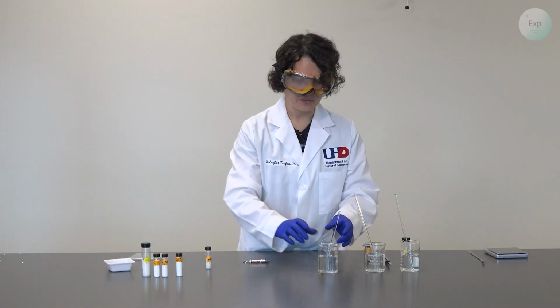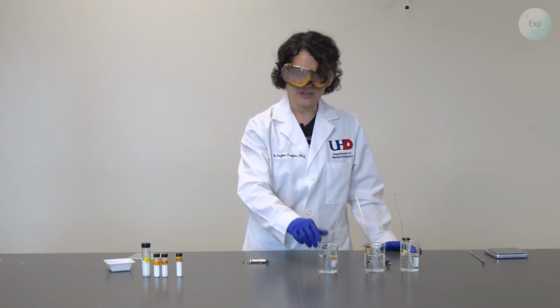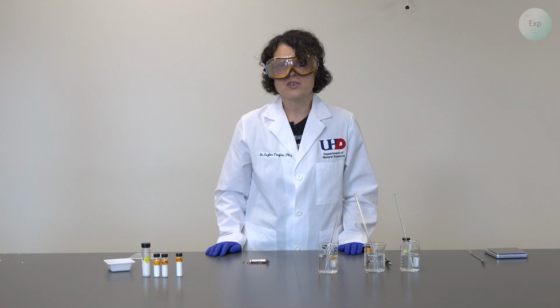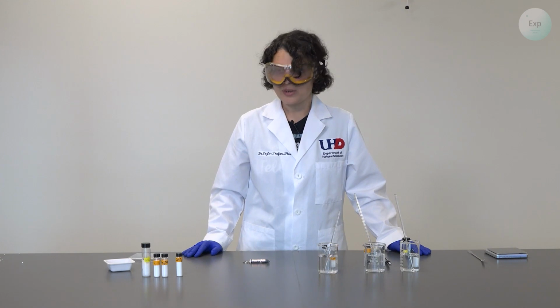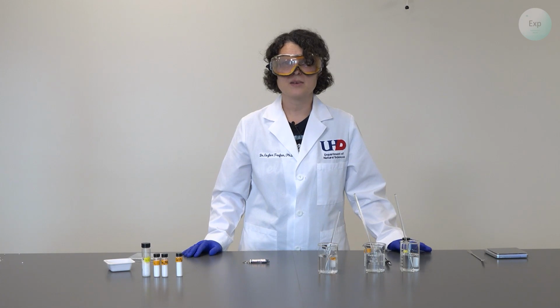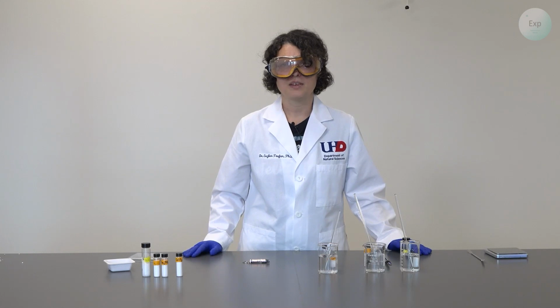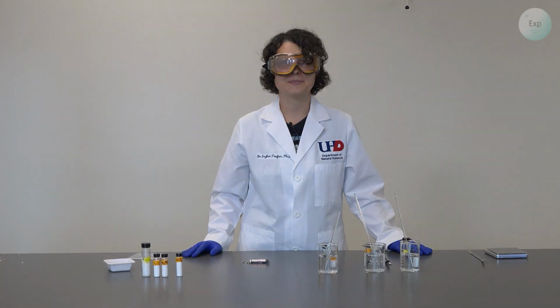We can conclude through these 3 experiments that most chlorides should be soluble because in our experience doing this experiment, the sodium, calcium, and magnesium chlorides are all soluble in water. If you were to expand this range of experiments, you can test your carbonates, your sulfates, and you can go beyond sodium, calcium, and magnesium to incorporate transition metals and essentially all the elements of the periodic table. When all these experiments are performed, then you may derive by yourself the solubility table of the ionic compounds of all the elements in the periodic table.